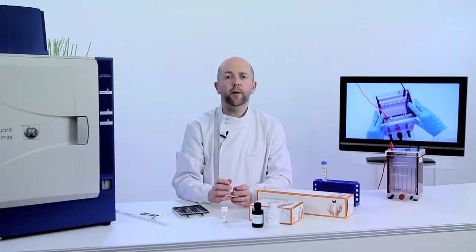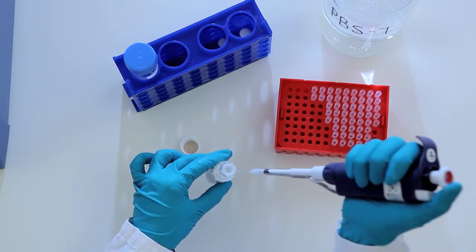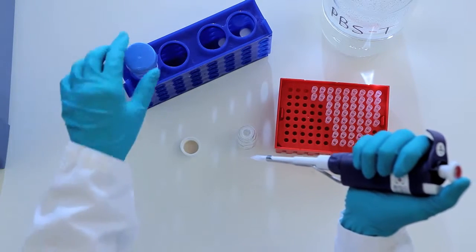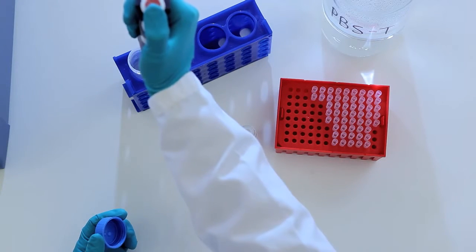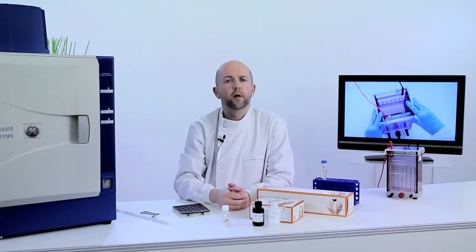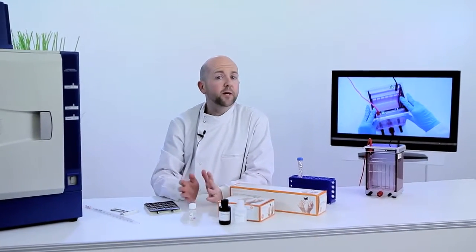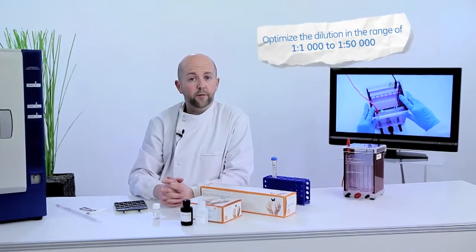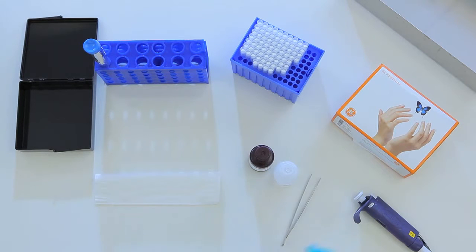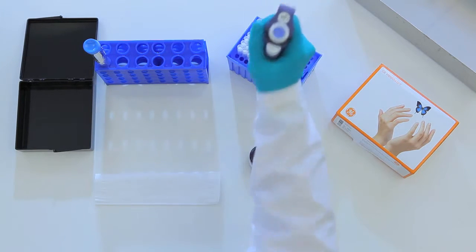Use this time to prepare the primary and secondary antibodies. Dilute your primary antibody with PBST. If working with phosphorylated proteins, you must use TBST. Always select specific antibodies of high quality and optimize the dilution in the range of 1 to 1,000 to 1 to 50,000. ECL Prime keeps precious primary antibody use to a minimum.